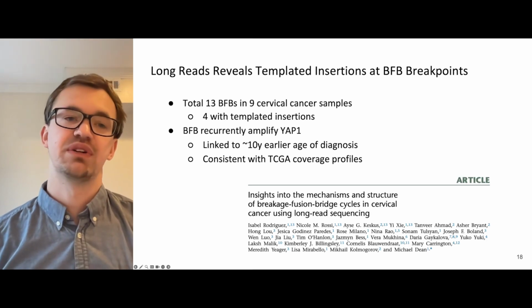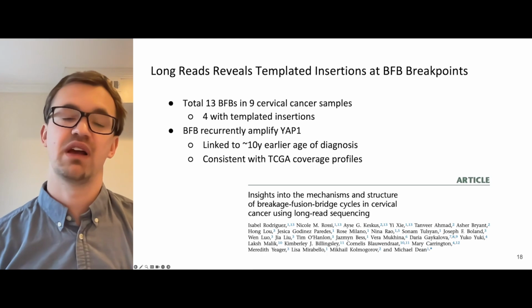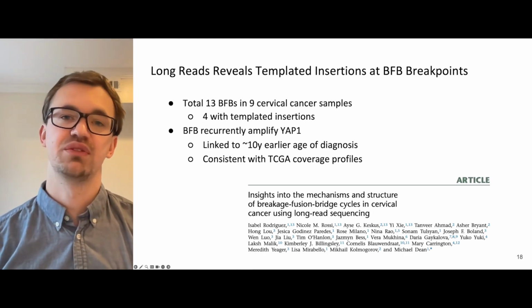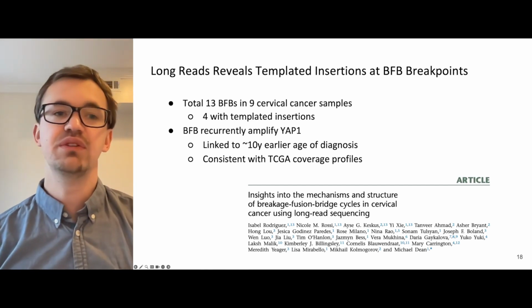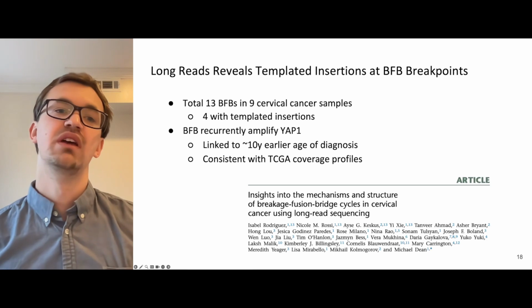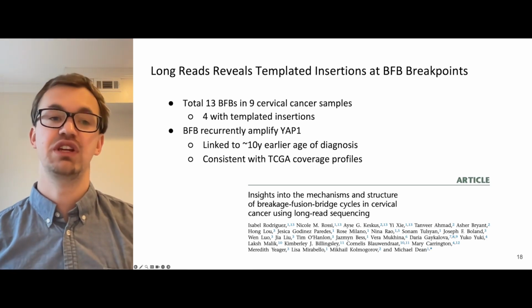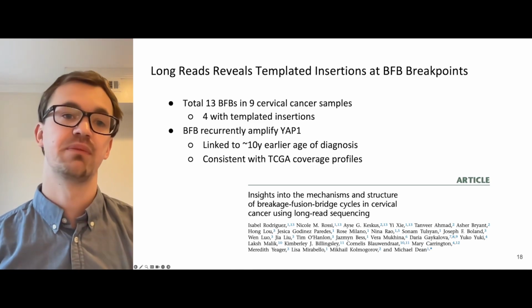In total, we characterized 13 such amplifications. 4 of them have these templated insertions that otherwise would be very difficult to see using short reads. We also found that this mechanism in particular seems to be responsible for amplifying the YAP1 gene, which is linked to a 10-year earlier age of diagnosis of cervical cancer.